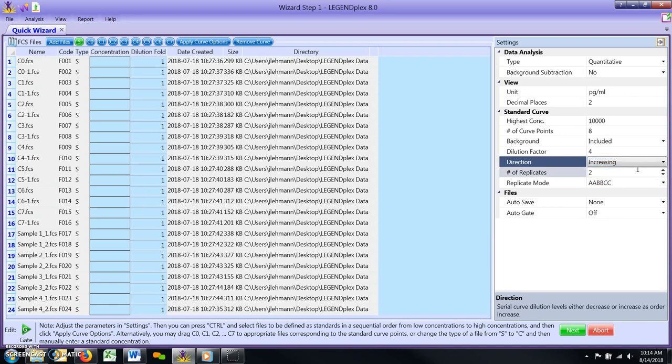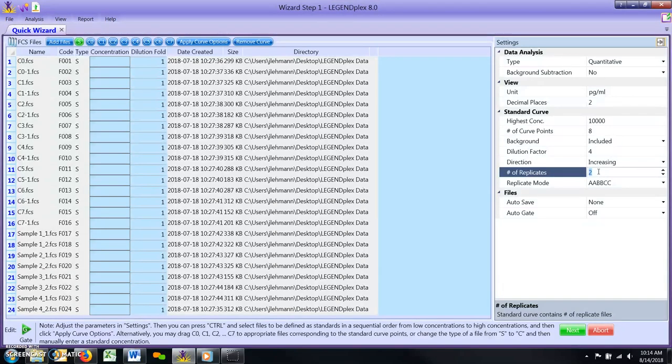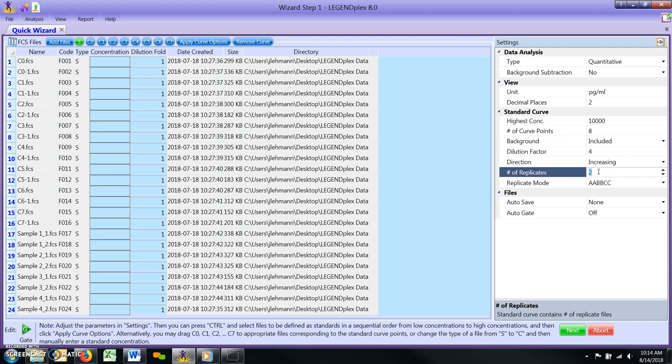Number of replicates. Ensure that this value matches the number of replicates you have for your assay standard curve points. The number of replicates for each standard curve point recommended by the manual is 2. However, some researchers elect to run the assay using a different number.